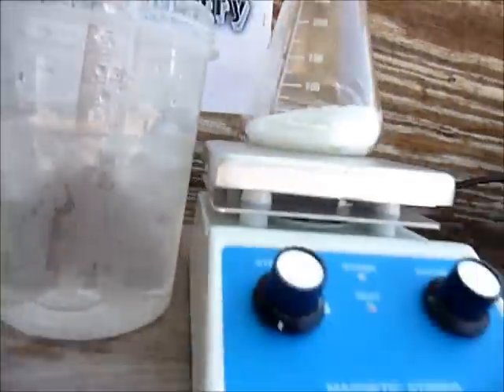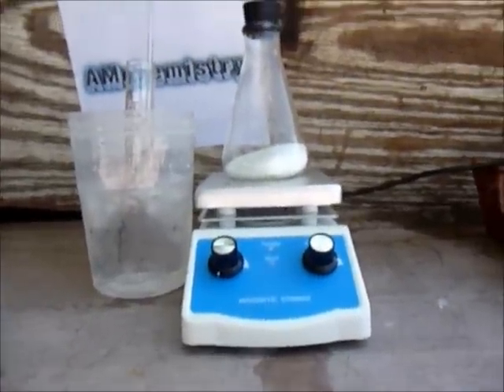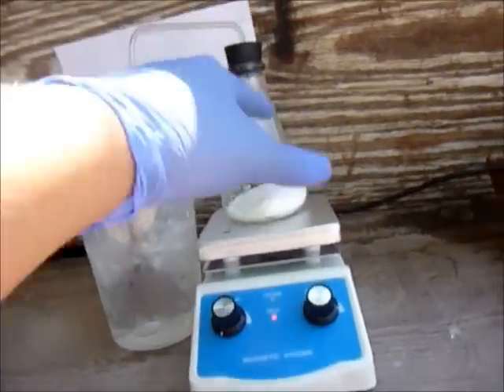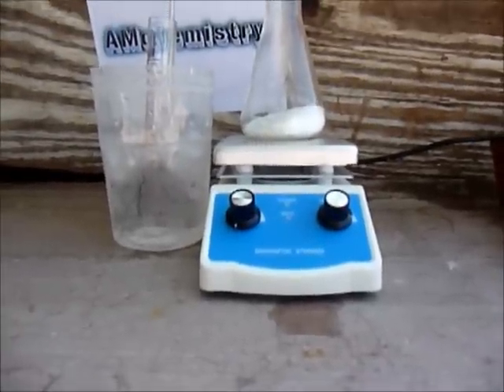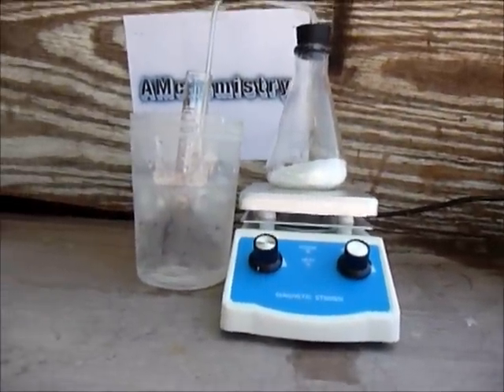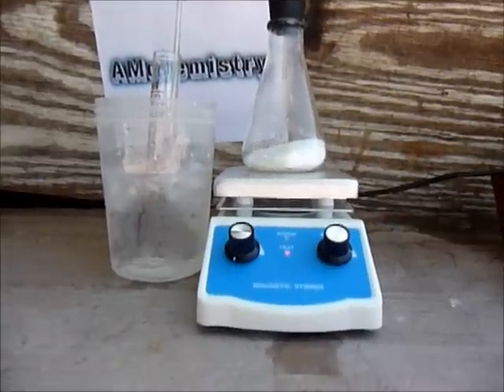It started bubbling as you can see right there. Keep one thing in mind: it will randomly just reflux. Reflux means that all the water here will get inside and your hydrochloric acid will get contaminated and not be pure enough. Right here it's supposed to be very pure hydrochloric acid without any contaminants, so just keep in mind that it may reflux.